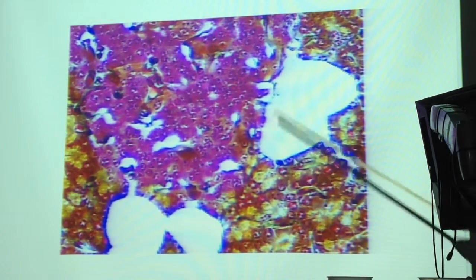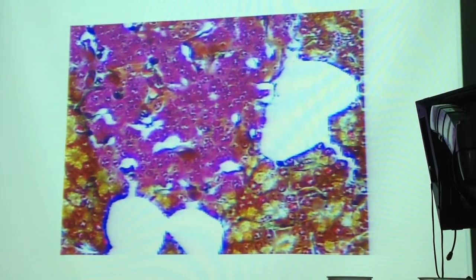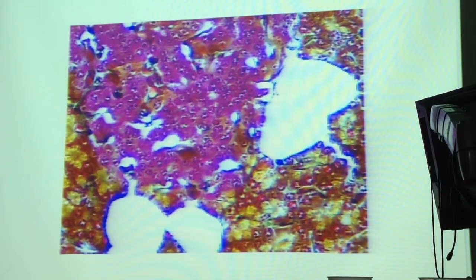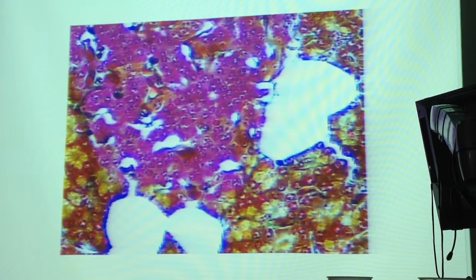But these, you see a different stain on them now, these are the islets of Langerhans, or pancreatic islets. This is the hormonal tissue. Remember I told you two hormones. Actually, there are four we're going to look at today. The cells stain differently. I'd like you to recognize them and know what hormone they produce.